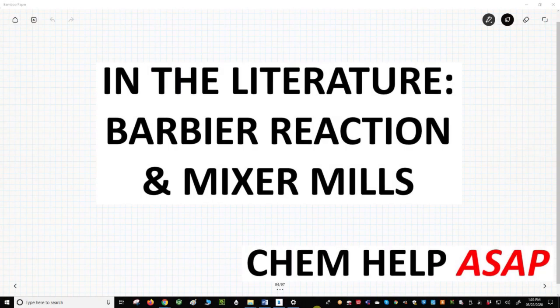In this video, we will learn about how a machine called a mixer mill can be used to facilitate certain types of chemical reactions. The research was performed by the group of Professor Duncan Browne at Cardiff University in Wales and now located at University College London. The work was published in the Journal of Organic Chemistry. The citation is on the following slides as well as in the video description.